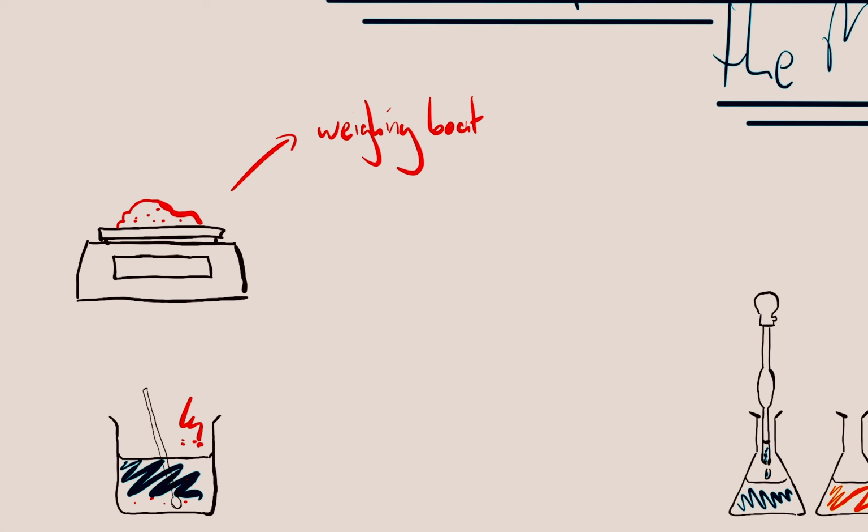On a balance containing our solid. We're going to measure our weighing boats and our solids onto our balance.